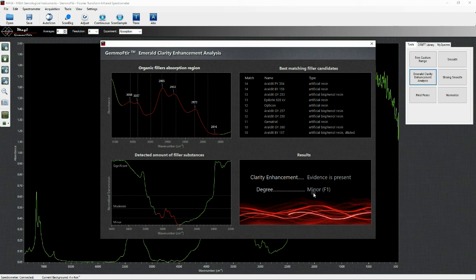For this reason, it's suggested to test emeralds in different orientations in order to have a more precise and homogeneous idea about the extent of the treatment. Since the infrared beam is not capable of scanning the whole stone, it's highly advisable to use other standard gemmological procedures like microscopic observation to make the call about this grade. It also needs to be stressed that this grading system is not based on objective and measurable data, and hence there could be differences of interpretation depending on the operator.